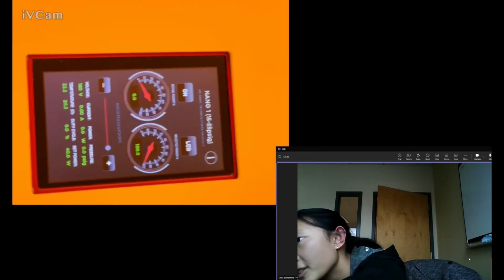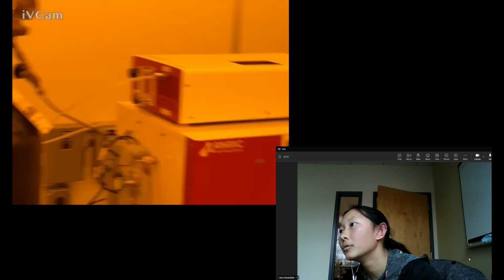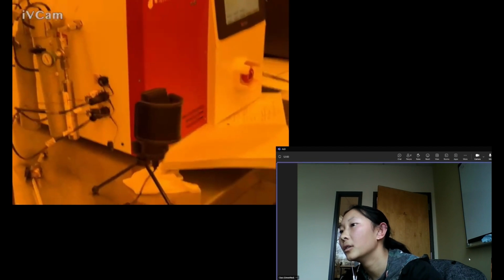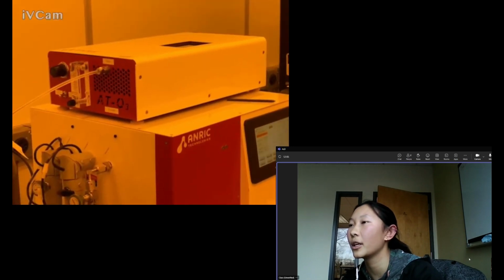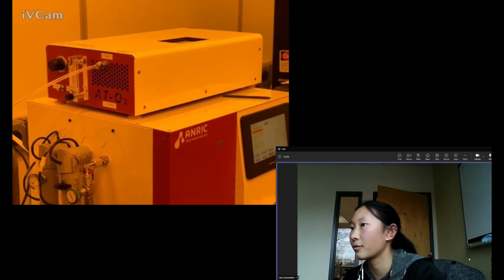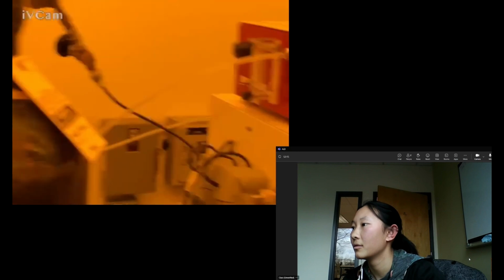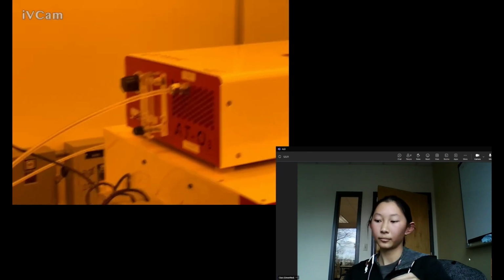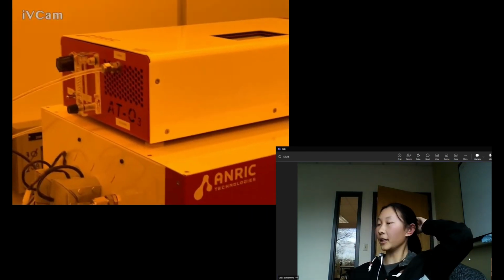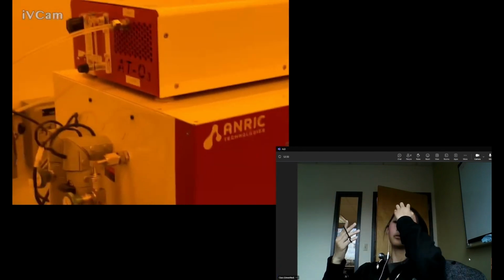It says zero, 0 psi. If you're turning on oxygen and it's flowing directly to it, there should be some sort of reading. They're checking the oxygen line in the back. And once it shows the reading, then you can adjust it with the knob. But anywhere between 15 to 20 on the ozone generator is fine. Okay, 15 to 20, perfect.